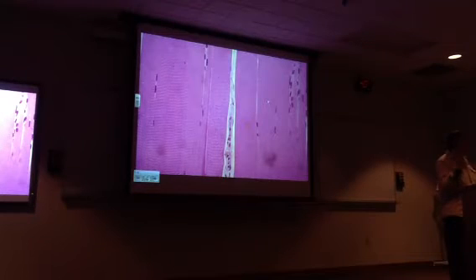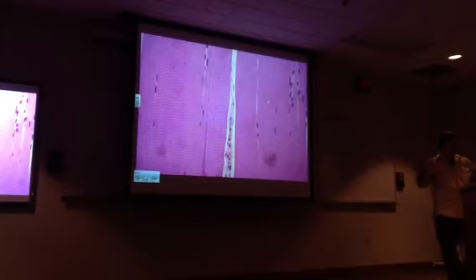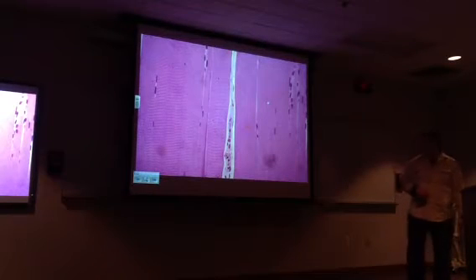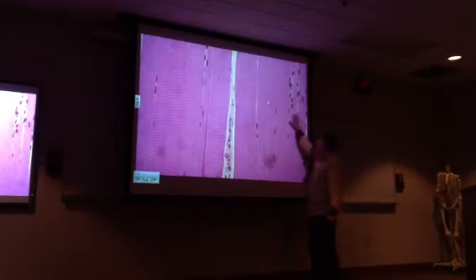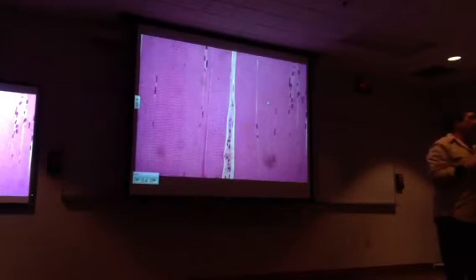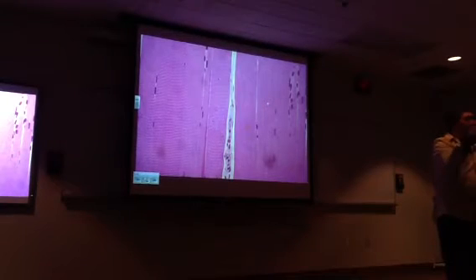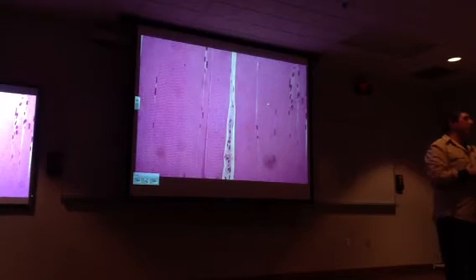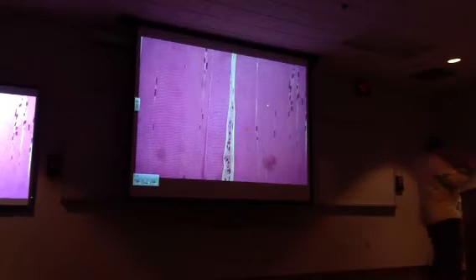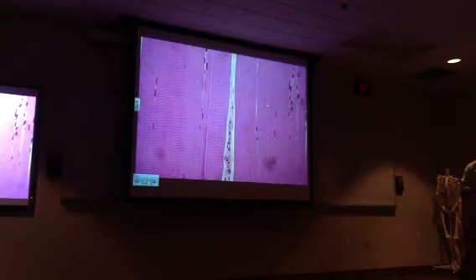All right, so I won't really ask you anything about the nuclei like that if it's an image laid out like this. I may ask what potential cell type these nuclei could represent, and I may have a whole bunch of choices, with only one of the possible choices as a right answer. Make sense? But I wouldn't ask you, just blind, to say what type of nucleus it is.